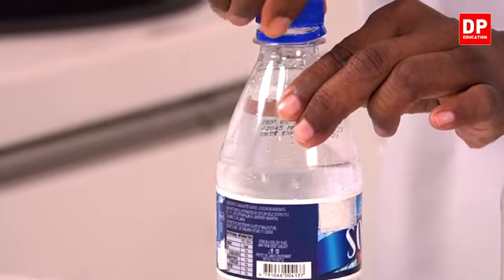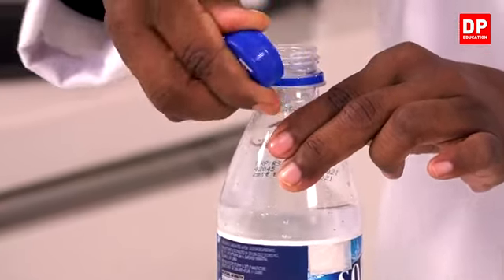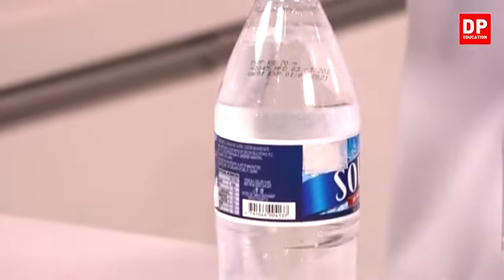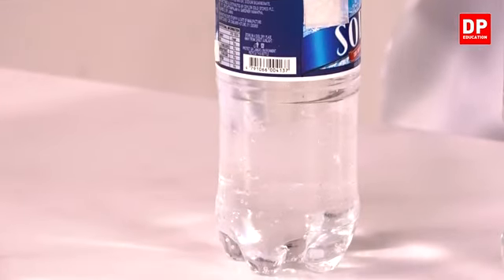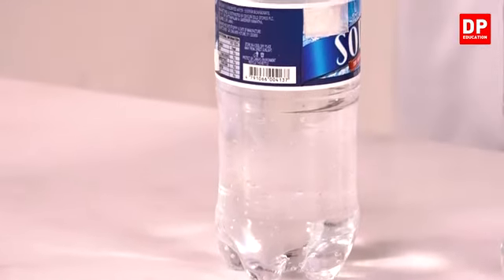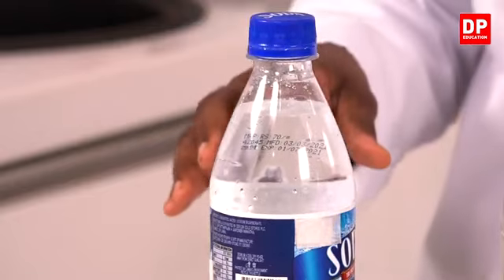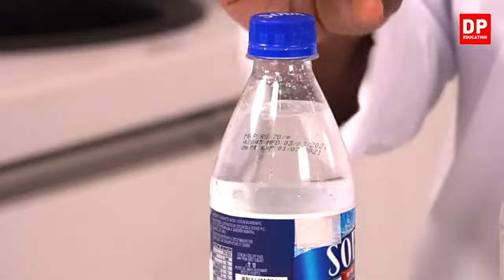Here still you can observe the evolving of gas. Okay. So I will leave it like this until all the gas evolves. So here you can see when the pressure was released, the homogeneous mixture became a heterogeneous mixture.